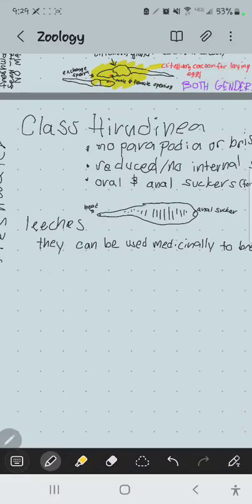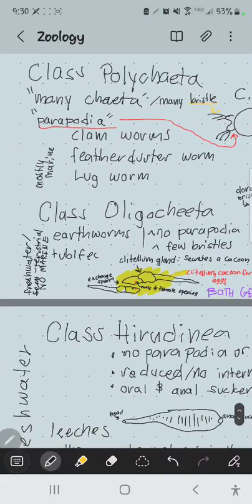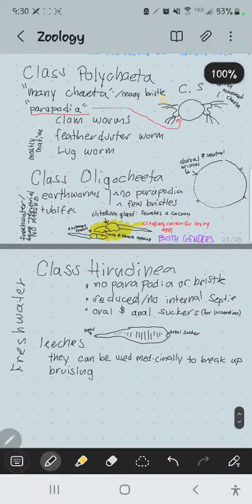Okay, so what this is all about here, and I have some leeches here. Here are my leeches. I'll put them in a little dish when we break, so take a look. That's the only ones I have. Most of the leeches around here in California are predators. They're not parasites. So you have to go to the south, like Mississippi or Louisiana, to get more aggressive, parasite-style ones.